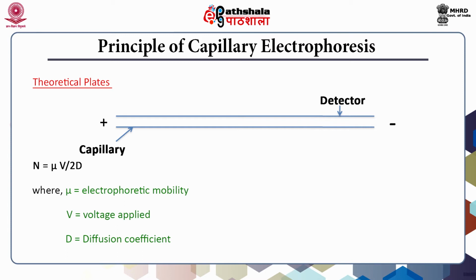The number of theoretical plates is linearly dependent on applied voltage, and hence the more voltage, the more theoretical plates. It may be noted that increasing voltage also reduces retention time.